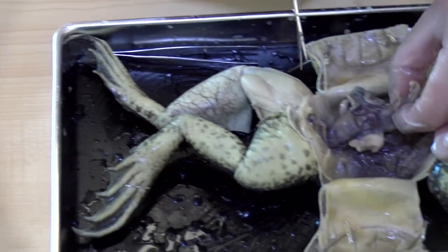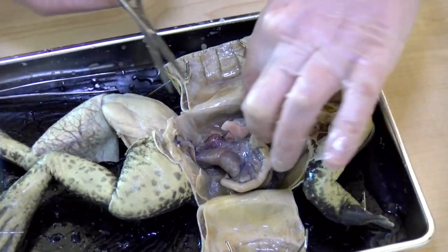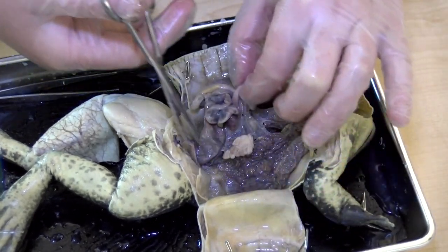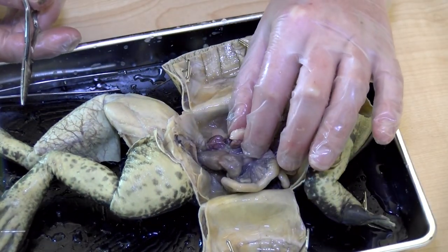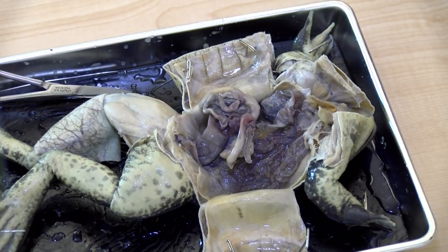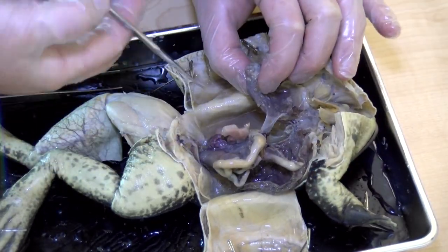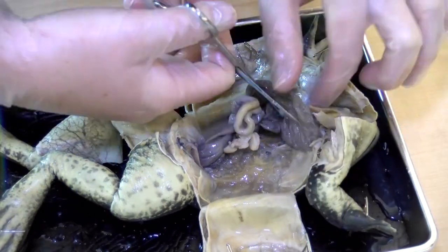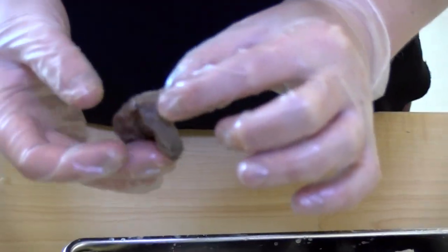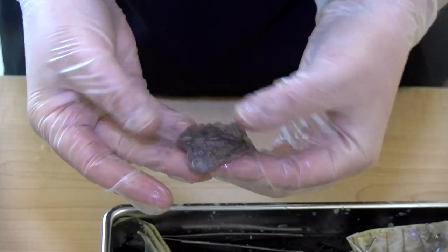Then we'd have our small intestine and large intestine. See all the little vessels and stuff inside the lung? It's actually a sac — it would fill with air. Very neat — frog lung.